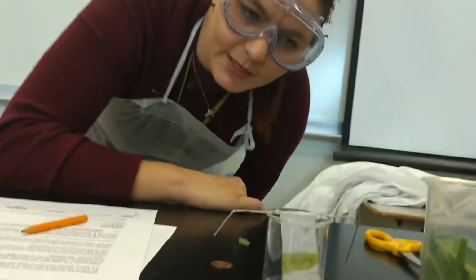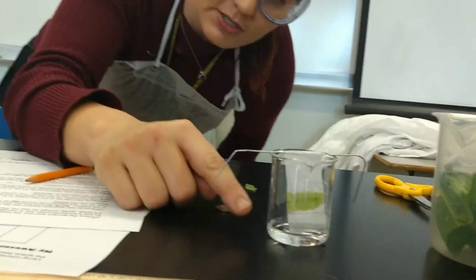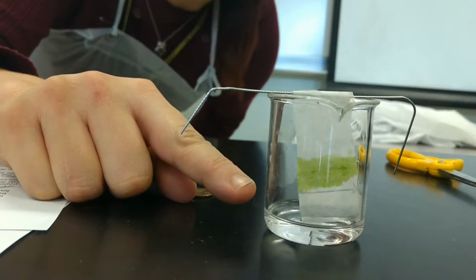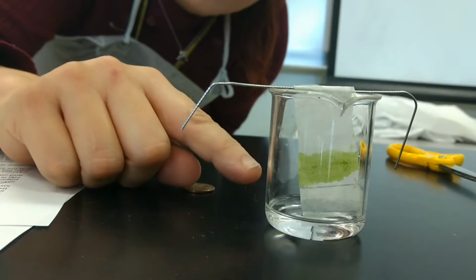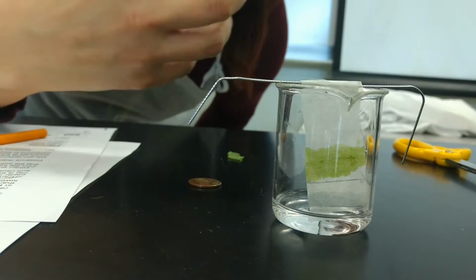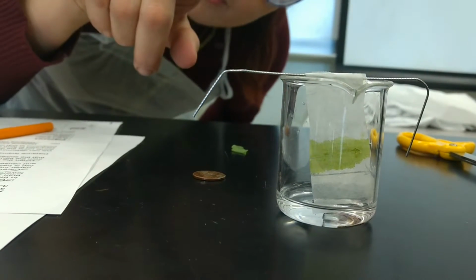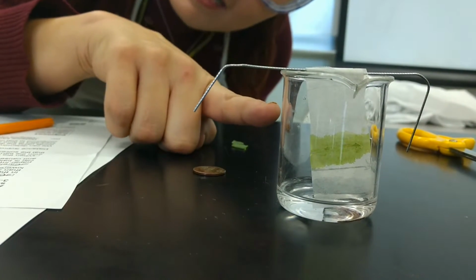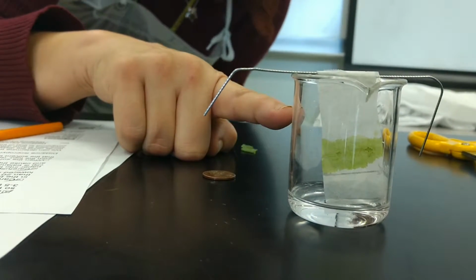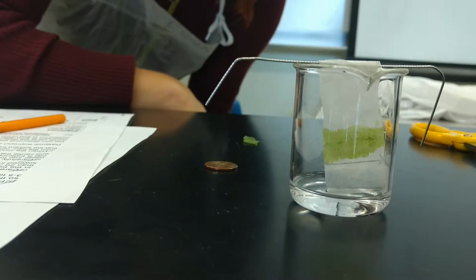Okay, now what we're going to do is we're going to sit and watch it. We're going to watch all of that liquid. You can actually see right now how some of the solution is starting to move, or wick, upwards. What you're going to do is watch it and just keep watching because it's pulling the solution from the paper that's in it upwards. Once it gets past that line, it's going to start interacting with the pigments in the spinach, and we're going to watch what happens with those pigments.